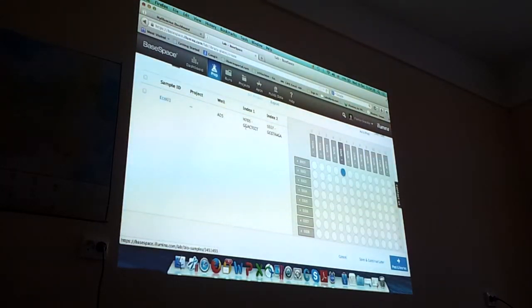Yes, it's this one. 705, yeah. So this has 2 G's. Don't use this one. So this one should not be used. All others are working. Only not this one. It is in the manual somewhere, but unfortunately here there is no warning. There should be a warning, of course. It would be much better.